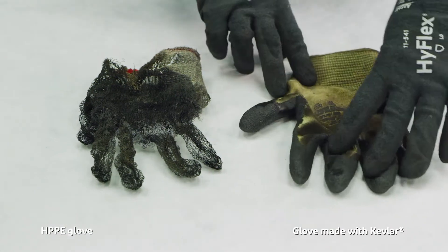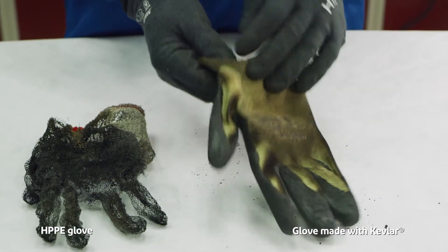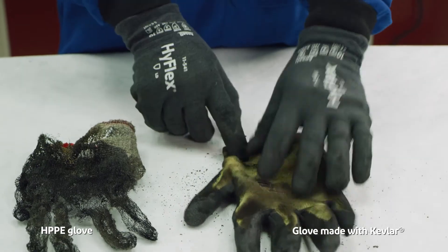You can see the Kevlar glove remains intact — there's not a problem with it at all. The neoprene coating looks a little charred but overall it's intact. The glove is flexible. If you look on the inside of the glove there's no damage, so your hand will be saved within the Kevlar glove.